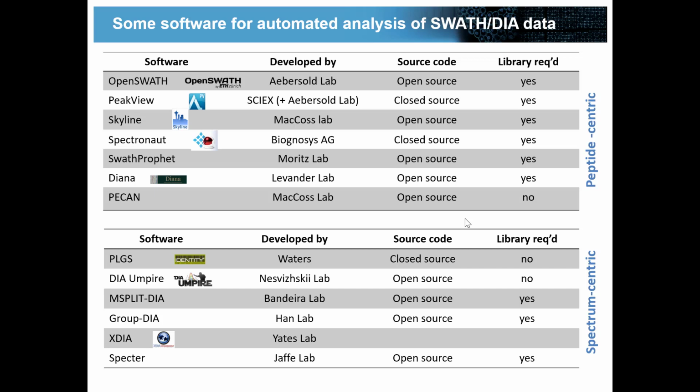Then you can go to commercial implementations. There's Biognosys, the company Rudy mentioned, which also produced a very slick software which is very well optimized, runs very efficiently, is easy to use, is probably reasonably well supported, but then you have to pay some money for this, obviously. So I would say there's a range of options.